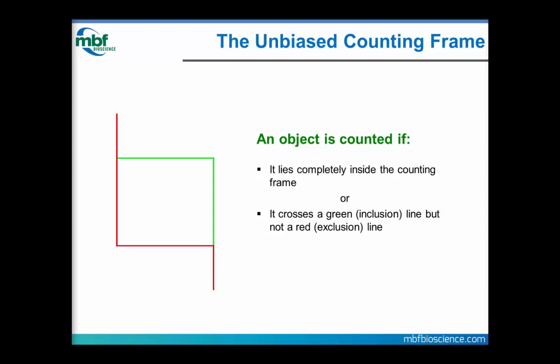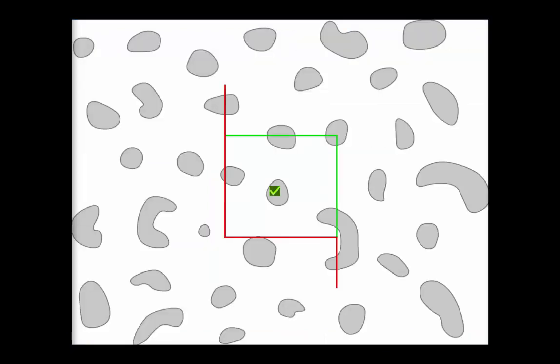So let's look at some examples. We focus down through the dissector, and we're looking at a cross section which is called the counting frame. This is how you hope they all appear, because this is an easy one. The cell top is obviously in the dissector.